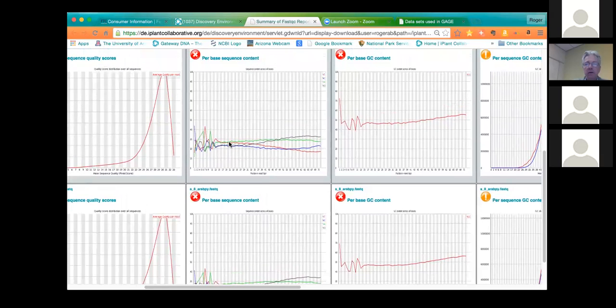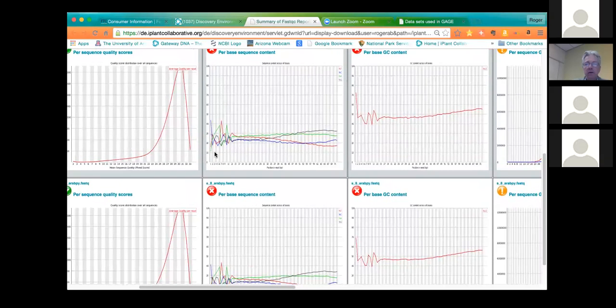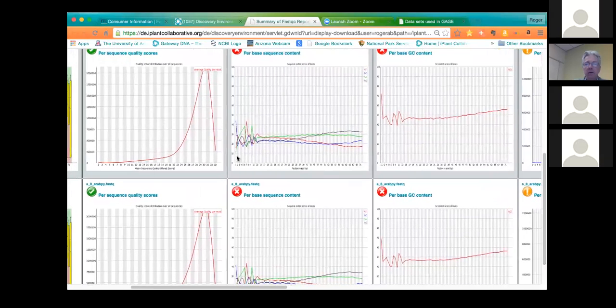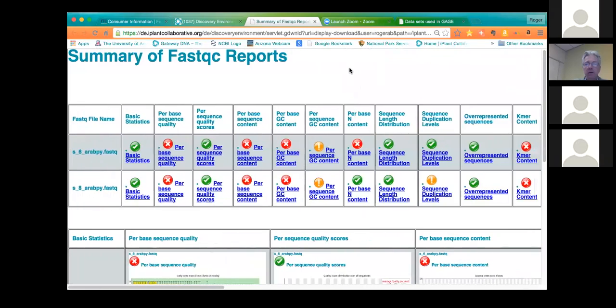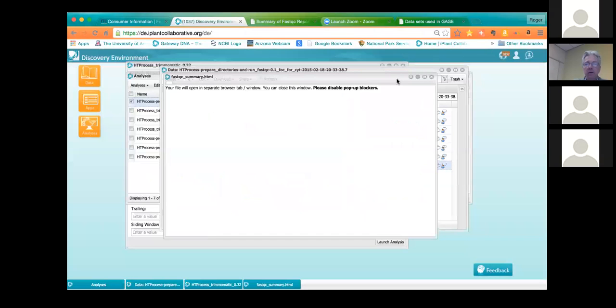And when I ran Trim-O-Matic the first time with this file, for example, I found that just using quality trimming didn't get rid of this. And so I was left with the decision, well, do I leave that in and just assume that since it's not a big percentage or a huge percentage of the reads that it's not going to screw things up too much, or do I want to get rid of that? And I decided that I wanted to get rid of that, and that's where I used head crop to just take that off the beginning of the reads. You know, there's a cost there, but the benefit is I feel more confident that I'm not trying to assemble sequences out of junk, and that's what it comes down to. You know, these experiments are our children in a way, and we hate to be harsh with them, but sometimes we have to be.